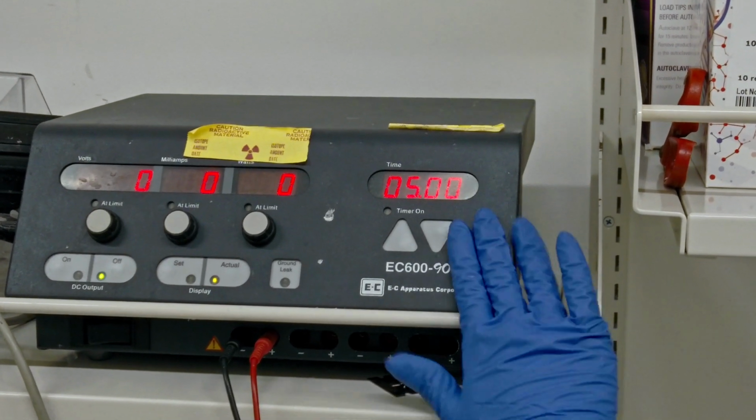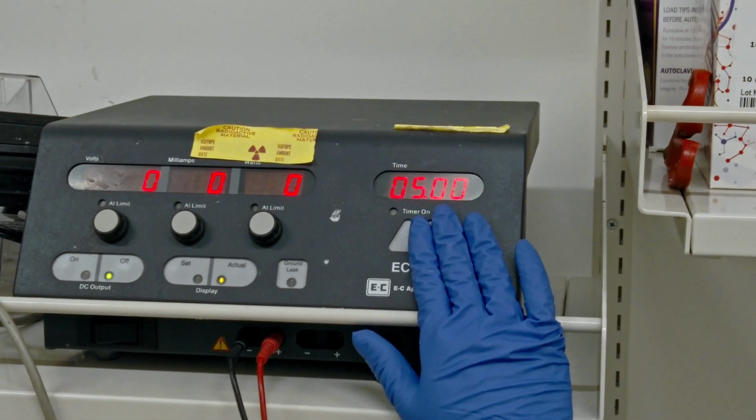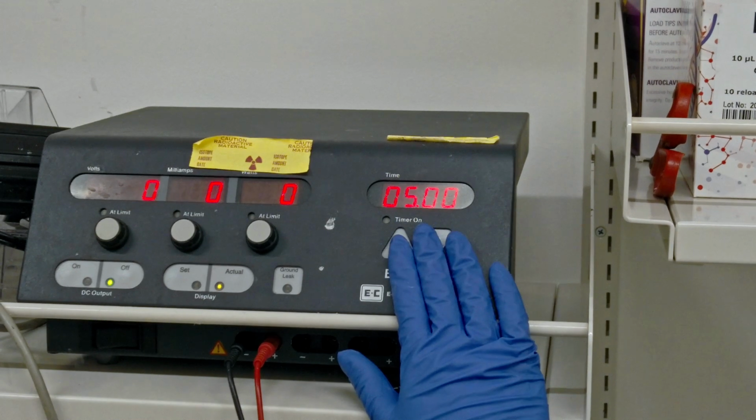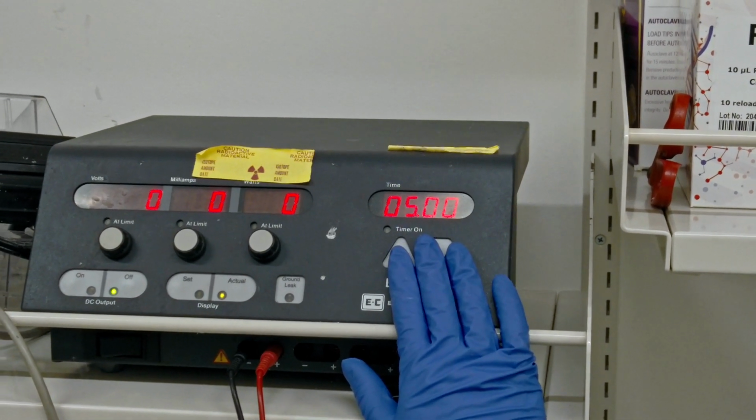Here you can already see that it has a timer for 5 hours. This is typically because we run the gel for about 30 minutes to an hour to preheat it. During that time, we're running one of our assays, and then we stop it, and it usually takes about another 3 hours max to run the gel.